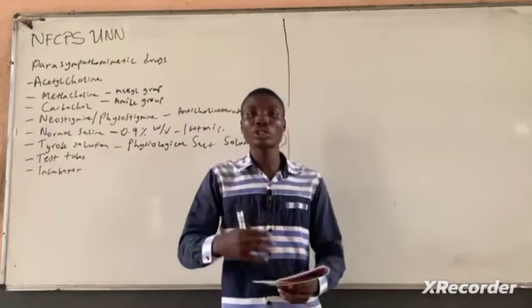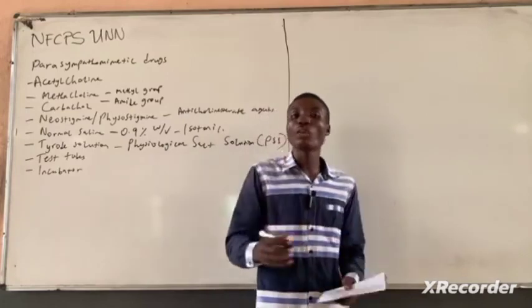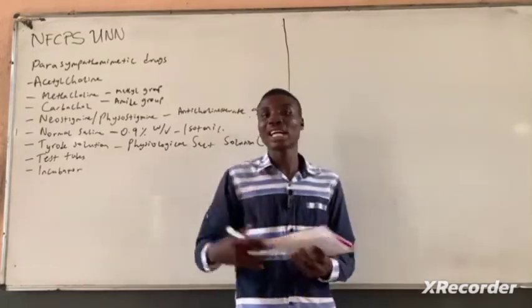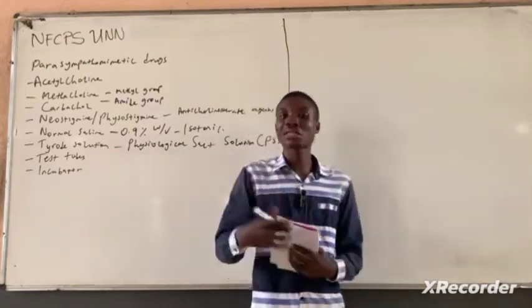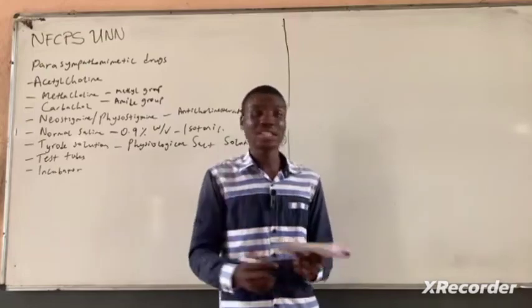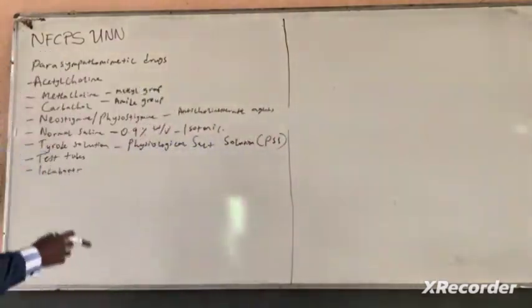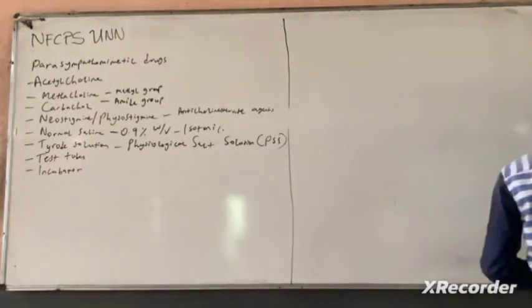But any concentration or any amount you're actually supposed to administer is in view of the concentration that is provided to you in the lab. So you must pay attention to that, and that's why we will need to run some calculations so you understand how to carry out those dilutions and do what is necessary. Now, let us just clean this, and then let's talk about some of the concentrations that you could be given in the lab.